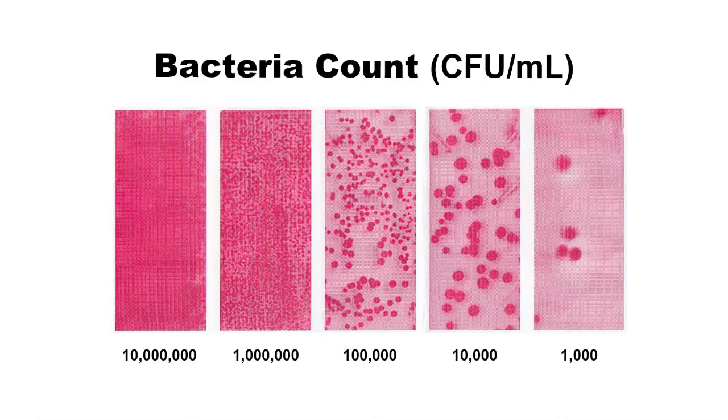Bacteria grow as red or colorless colonies. To determine the number of bacteria, compare the colony density on the transparent slide with the colony density on the bacterial chart. Colorless colonies should be included in the comparisons. It is the number of colonies, not the size of colonies, that is important.